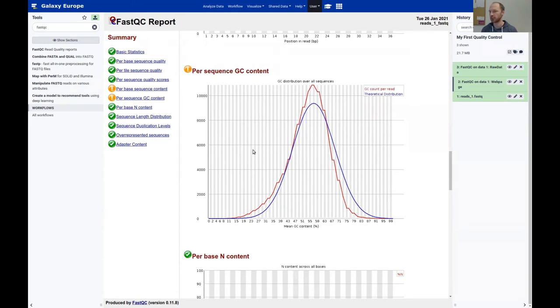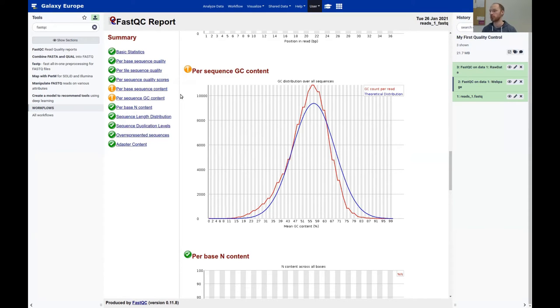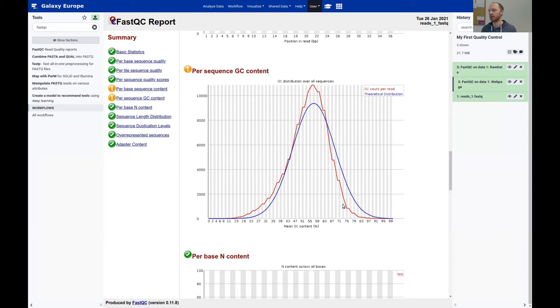The per-sequence GC content also shows a warning sign. The blue line is the theoretical distribution, the red line is the empirical distribution. On the x-axis is GC content in percent, on the y-axis the number of reads with that GC content. It shows a warning because the distribution is shifted and a bit spiky — again, an indication that there may be some foreign sequences or bias in the read library.